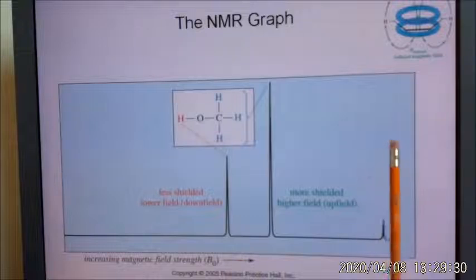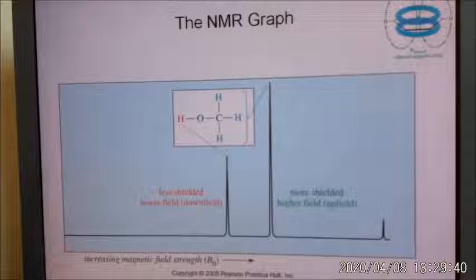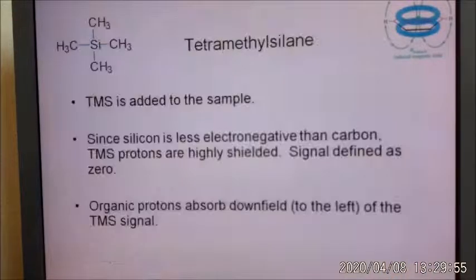So this is very typical. All you're going to see is mostly your protons here. Is it possible you can see anything to the right of TMS? If you do, and it is possible, okay, I've seen something at negative 0.2 ppm, really, really, very beautiful. That gives you a very strong indication of what kind of environment that proton is in. It's more shielded than even TMS.